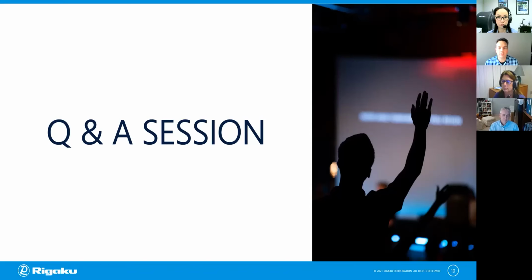Okay, all right. I'm going to try and get one more question, but it might be that you have to answer this one offline, because I'm not sure we have time to show it. John asked if we could show an example of how to export the STL file format from Dragonfly. So my question, actually, this would be a quick one to Mike. Do you have an example of this in your webinars or your YouTube videos? I don't know, there's too many hours of content to remember. Okay. It's like just 40 episodes. You just right click on the surface mesh and then say export to file, and then it'll let you choose. I think it's STL on the right click menu. Yeah. And it's all in the help menu too. Okay, good, good, good.